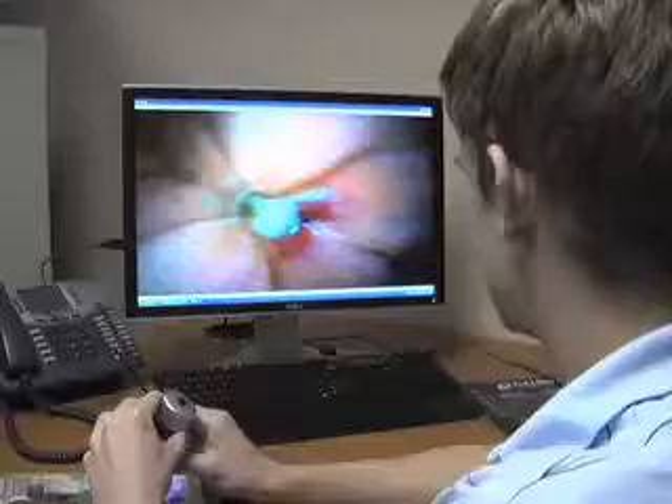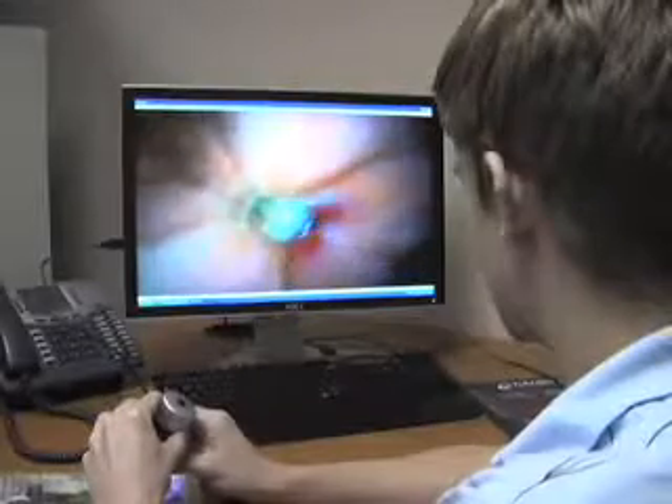This digital microscope displays a live magnified image on your computer screen. Its magnification ranges from 26 to 130 power.